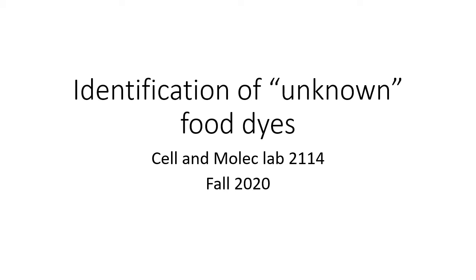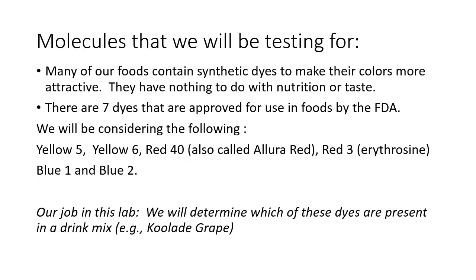This is our fun food dye lab, and a lot of people actually like this lab better than a lot of the other ones, because it's colorful, it's easy, and it's kind of fun. Not to say that the others aren't fun, they're all fun.